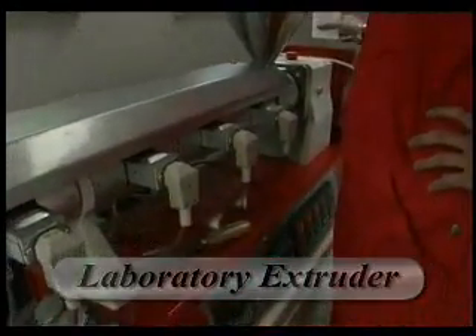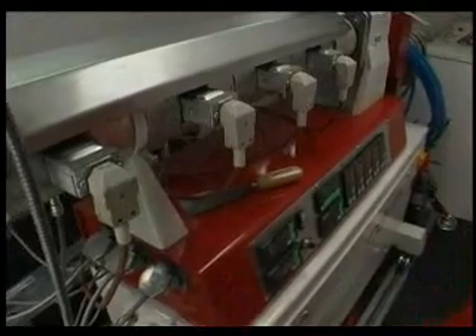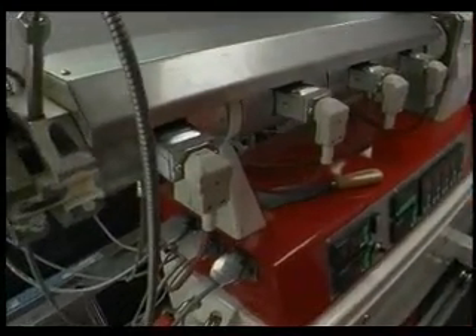When the extruder has reached its required temperature, the extruding of the sample can take place.